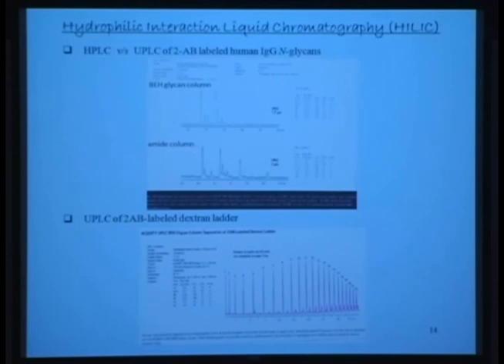So this is HPLC, and HPLC is 3 microns. This is 1.7 micron particle size. And you can see, one, the profile is different. It's fairly similar also, but significantly different. For example, if you see these 3 peaks here versus these 3 peaks here, much sharper baseline result. Likewise, you can see that this particular peak is a duplet, whereas here you can't even make it out.